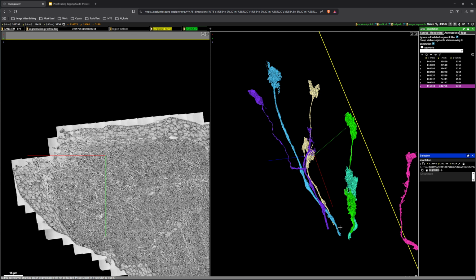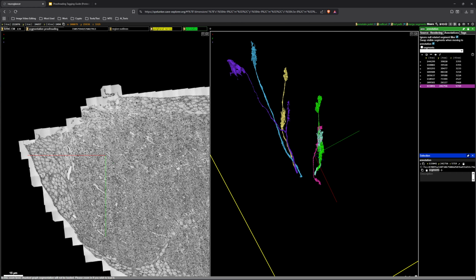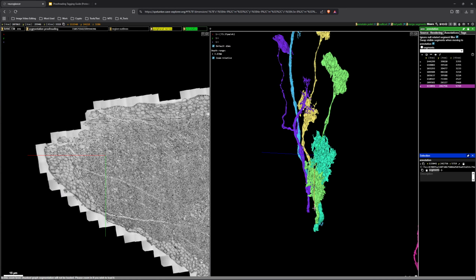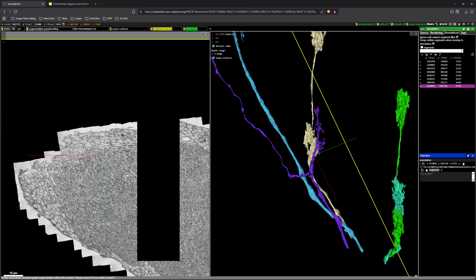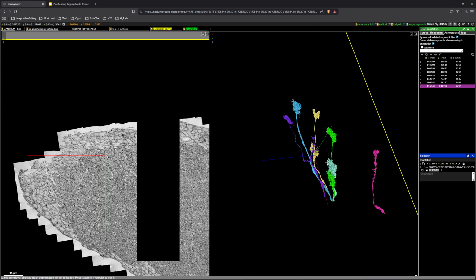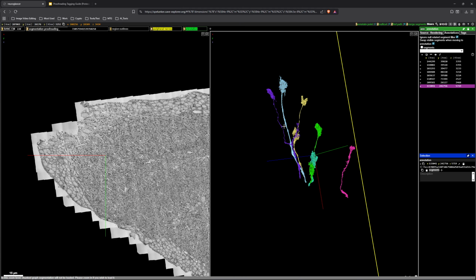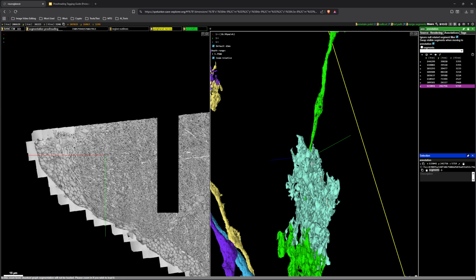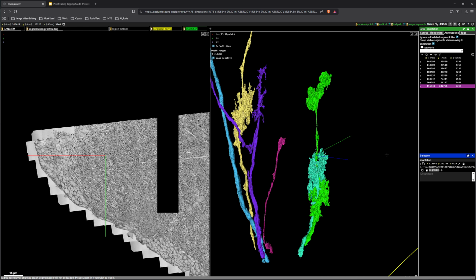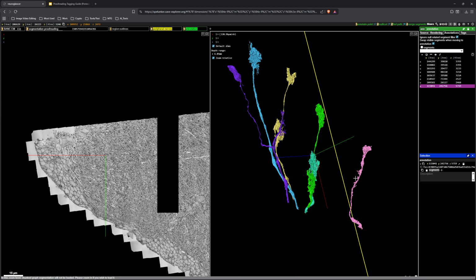Sometimes they got their soma. Sometimes they don't. Sometimes they do a little L shape. Sometimes they're sort of stockier. Just have this piece here. One thing to remember besides that, these all would get the backbone proofread label. So all, let's see, 1, 2, 3, 4, 5, all 6 of these would receive the backbone proofread label. One thing to remember is if this segment doesn't look like any of these, right?